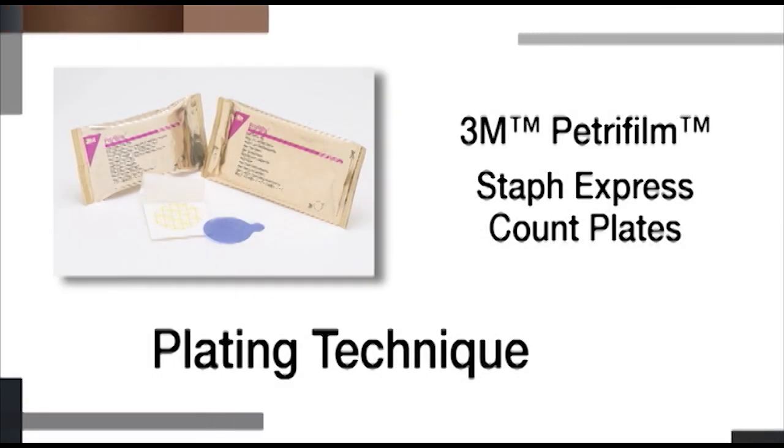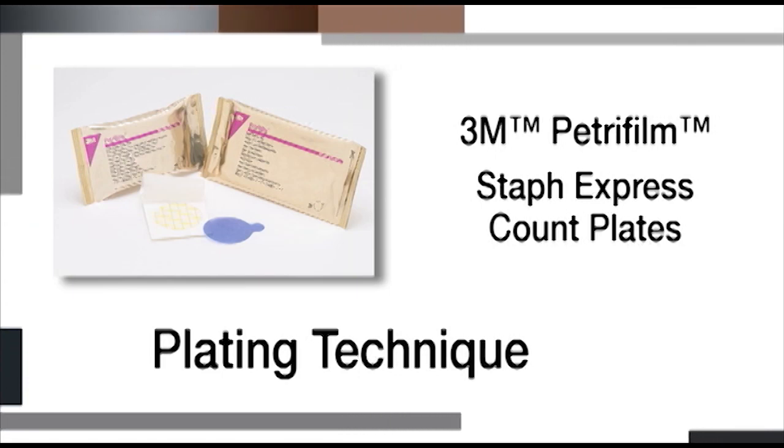Here is the plating procedure for 3M PetriFilm Staff Express Count Plate and Disc. This plate also features a foam dam to contain the inoculum.